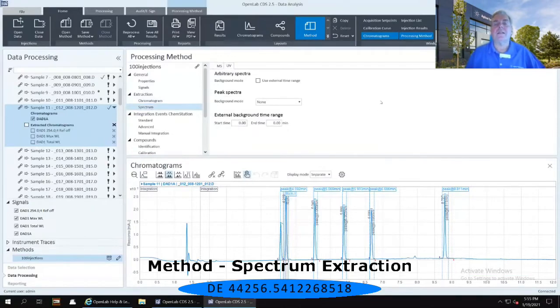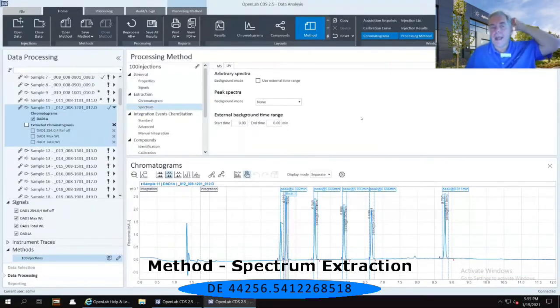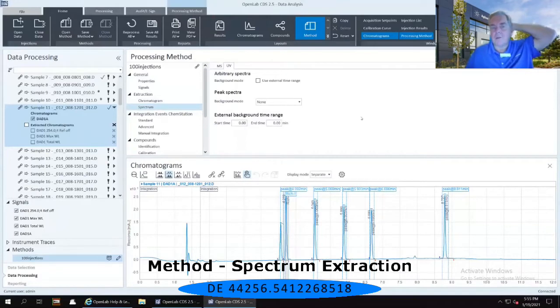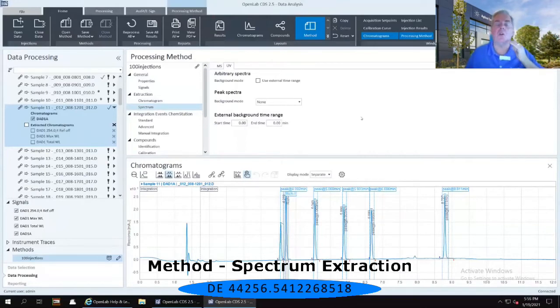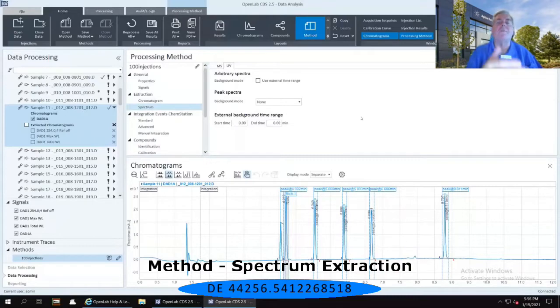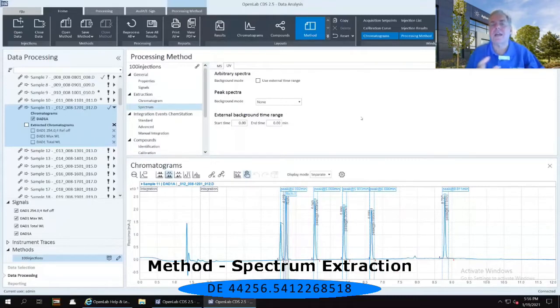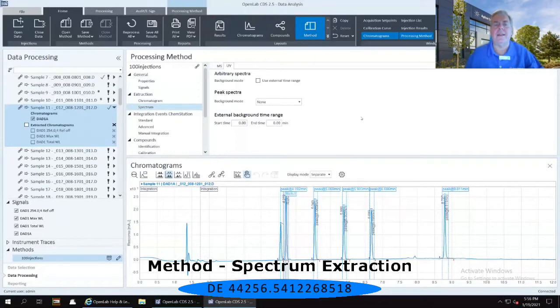This allows me to do a background subtraction, a spectral background subtraction, on all of my injections if I wish. And there are several ways in which I can do that.